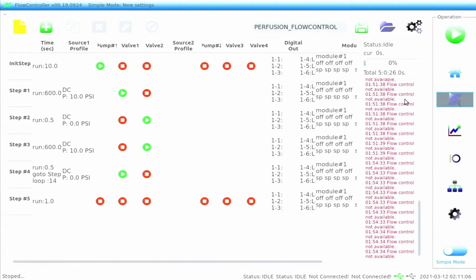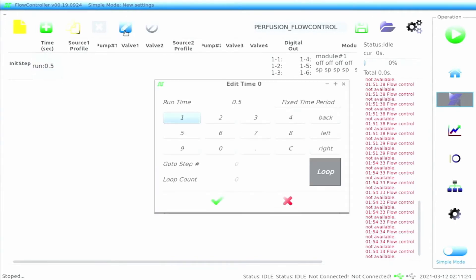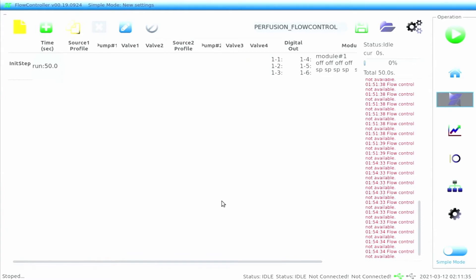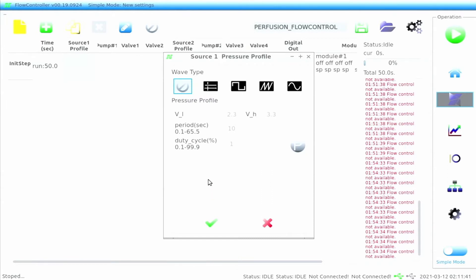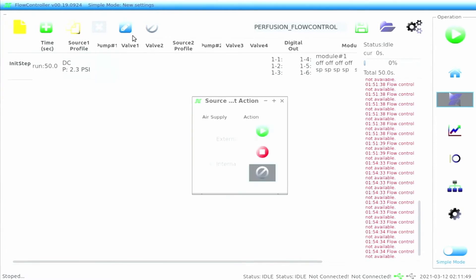The yellow icon in the top left will clear away any old scripts. The first row, labeled Initial Step, will change the start mode for the script. If you click in the cell under Time and then click the blue Edit icon, the user can change the run time as well as set up any loop conditions. Selecting the cell under any of the sources will allow the user to change the pressure parameter settings for that source. The cells under the valves allow the user to enable or disable individual valves.